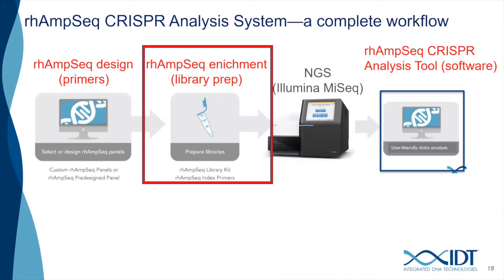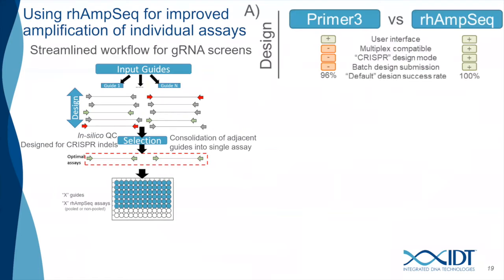So then next, focusing on the actual amplification, the library prep. So we've got the primer designs then. First, I'm going to show an application of using this for that singleplex application if you're looking at editing from a guide RNA library. So this may be where you're at the first stage and working to pick which is going to be my lead guide RNA candidate to further study for my therapeutic target or for my disease stage.